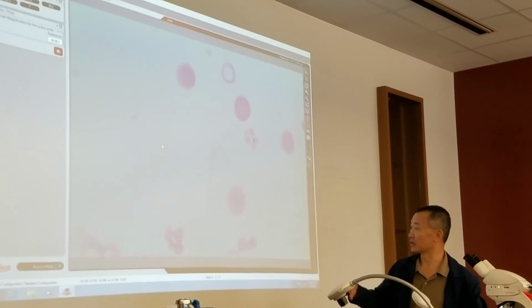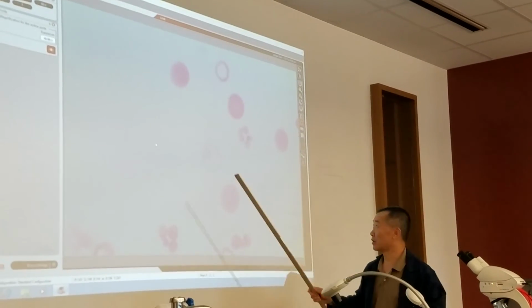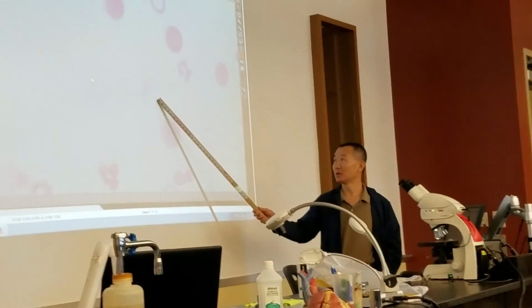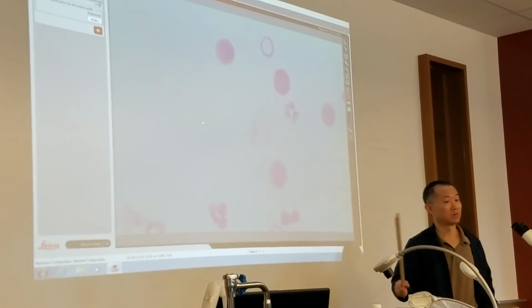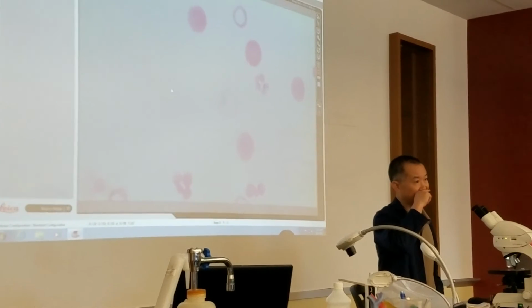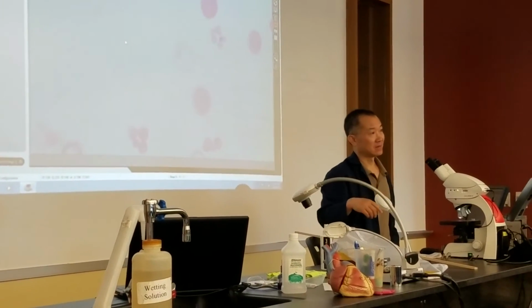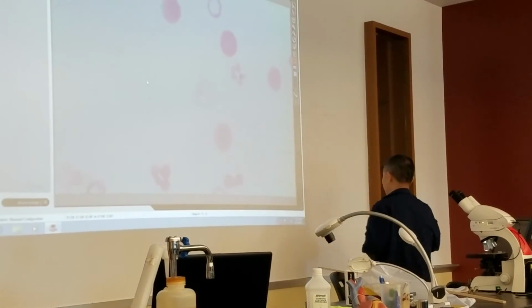It's a bit fuzzy over here. For example, I will ask you the space. It's blastocoele. The opening is the blastopore. We ask you what's the future structure of the blastopore. You say anus.